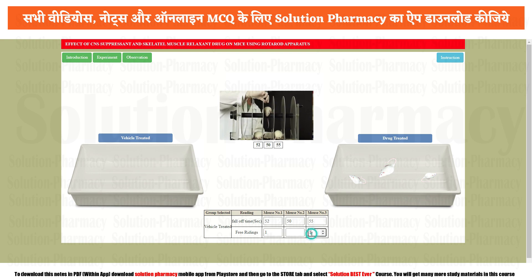So we have completed the vehicle treated group. Now it's time to do the same with the drug treated group. Click on any rat and three rats will be placed over the rota rod apparatus.